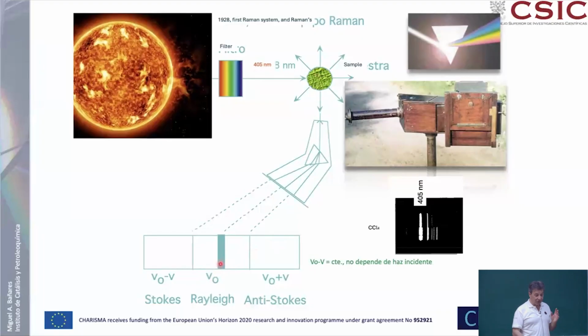Additional peaks that actually, interestingly, had a different energy, sometimes higher, sometimes lower, but symmetric. I mean, if the frequency increases like 10, then you get minus 10. And if it increases like 20, you get minus 20. Some of them were stronger than the others, but the relative position was always symmetric with respect to the excitation line. And the photograph looks like this.